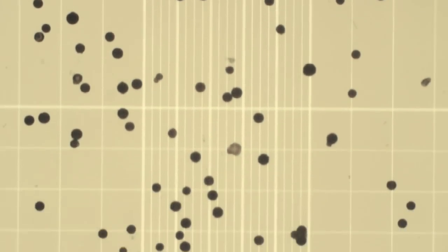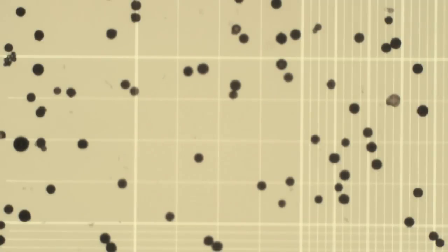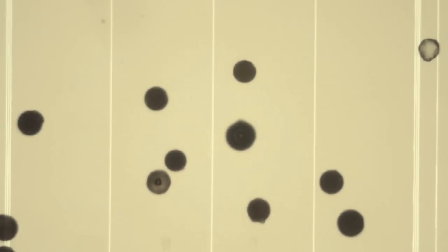And for this demonstration, I've used some very large particles to make this very easy to count. We're looking now at the upper left counting chamber, and what we want to do is to drill down to the 100 magnification. Right now we're at the 4 power, and so we're looking at it at a total of 40 power, including the objective, and we want to drill down to the 10x objective. And now we're going to very carefully, using the fine focus, look in this chamber, and now we want to count all 16.